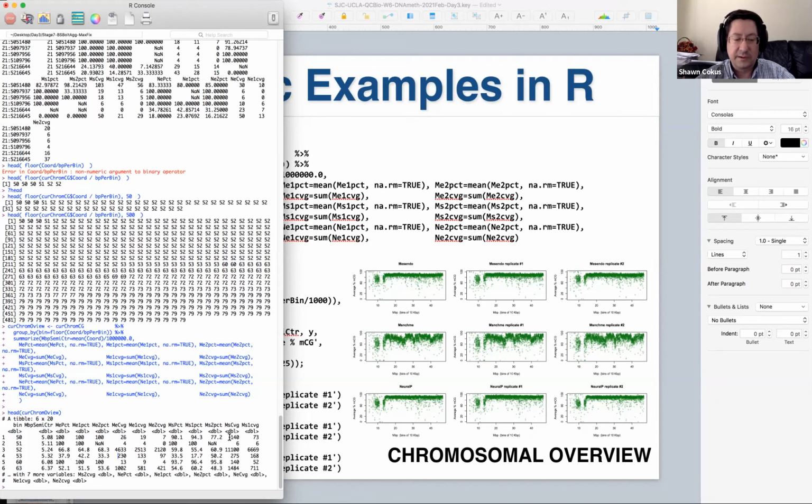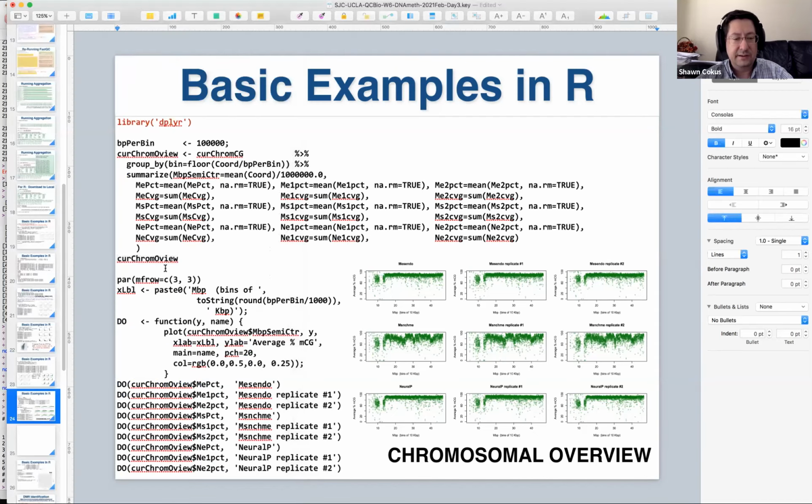Anyway, it's ready to plot now, basically, right? It doesn't even show us all the columns, but at least gives us the names. This is kind of what head does for tibbles. They stop you so you don't just get endless screens full of stuff if you have a really wide tibble. So we are ready to plot. Okay, that was the hard work.